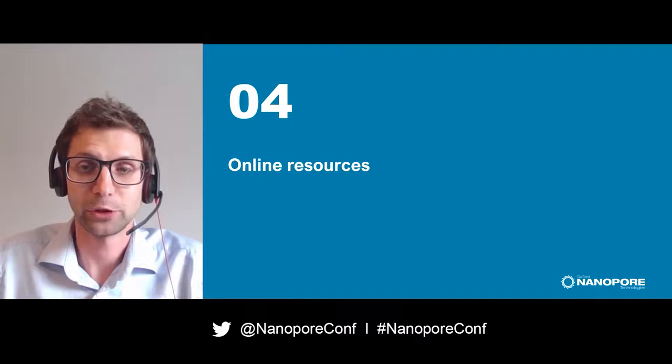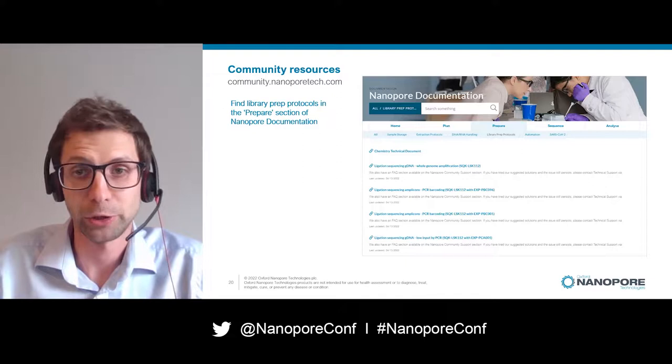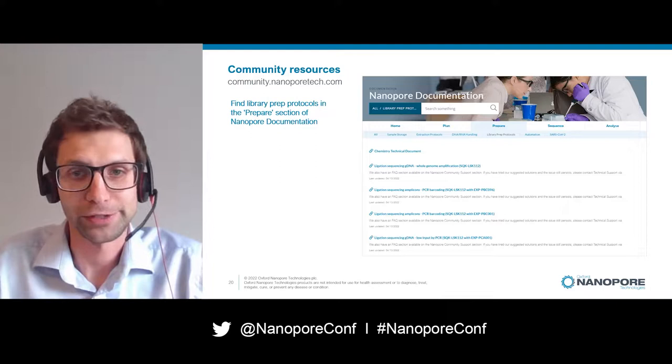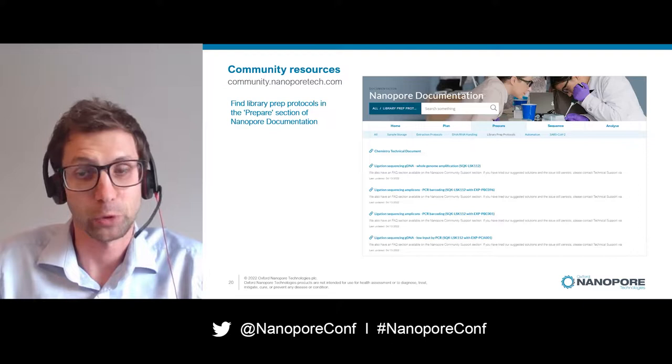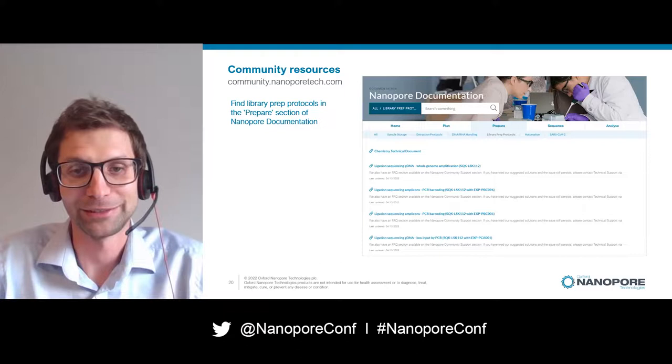Finally, I would like to highlight online resources that will further support your kit choice decisions. Within the documentation section, you can navigate to the library preparation protocols and also utilize the protocol builder to provide you with a customized workflow for any experiment of your choice. And once you have selected your strategy, you might also want to consider or review other steps in your sample preparation, sample extraction. And so you can also look at different tabs, but I would also recommend reviewing the relevant masterclass sessions.